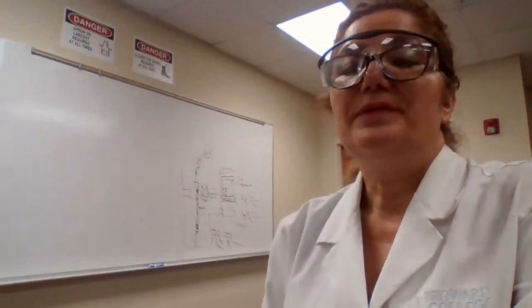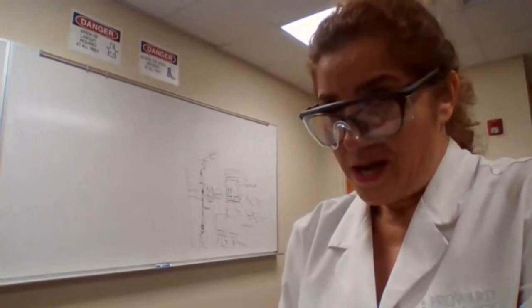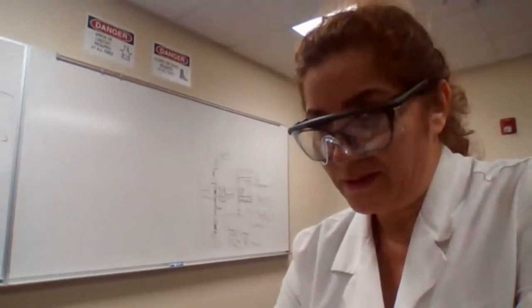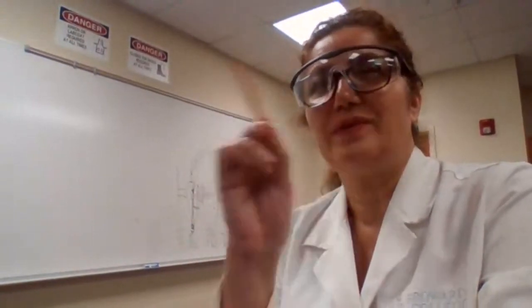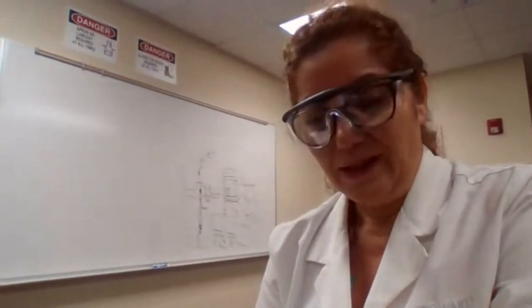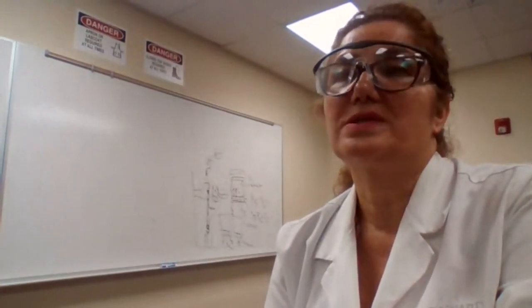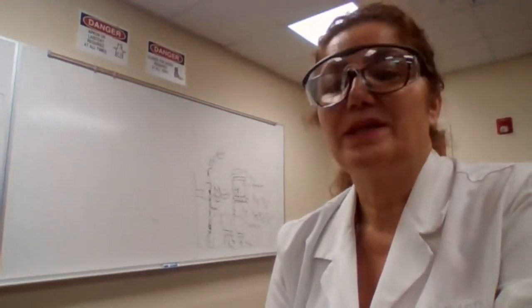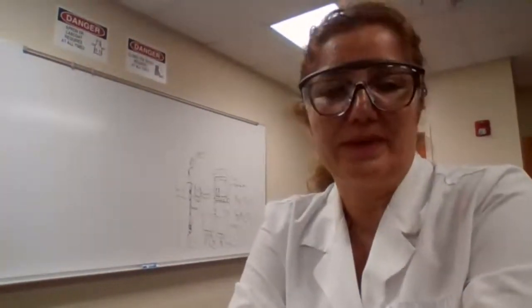For the second part, we are not doing gas chromatography. We do have two gas chromatography instruments that we have. The power that we need is a 220 for those, and what we have in that room is a 110 and has not been fixed yet, unfortunately. I wish that it gets fixed as soon as possible so we can use the two brand new instruments that we have, but it doesn't work yet.